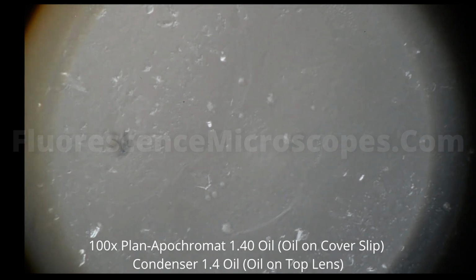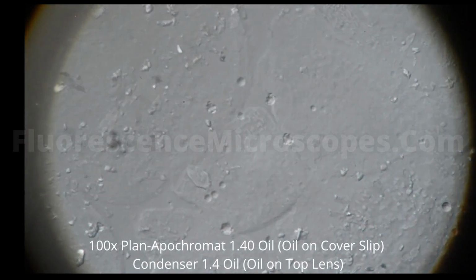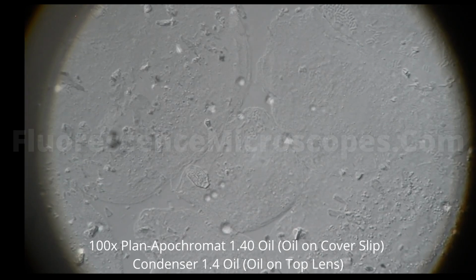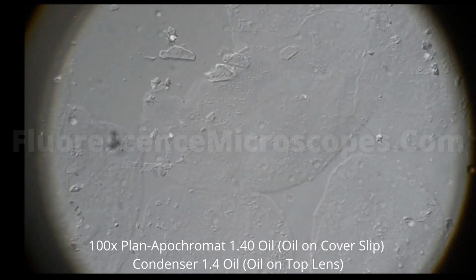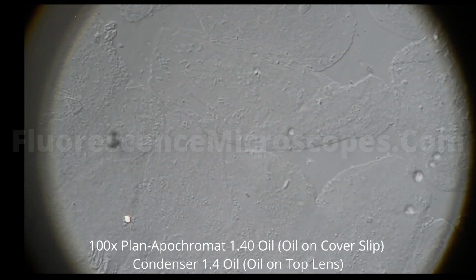Go back through the pseudo dark field, and now we're into the positive bias. And I'm just going to move around on the slide a little more. And I think that's about it.